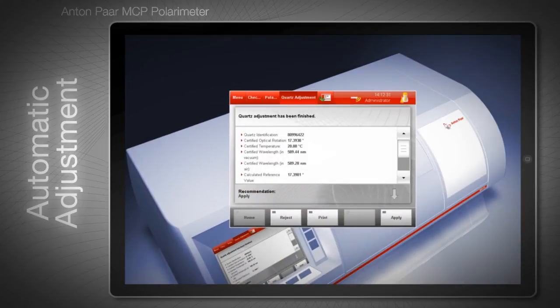The instrument selects the right value from the electronic tables and adjustment starts automatically. After the adjustment has been carried out, the MCP software recommends applying the adjustment or repeating it, depending on the adjustment result. Each adjustment is automatically stored in the MCP's audit trail, together with the user and quartz plate number for full traceability.